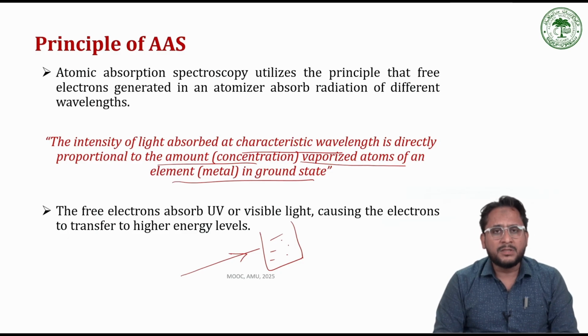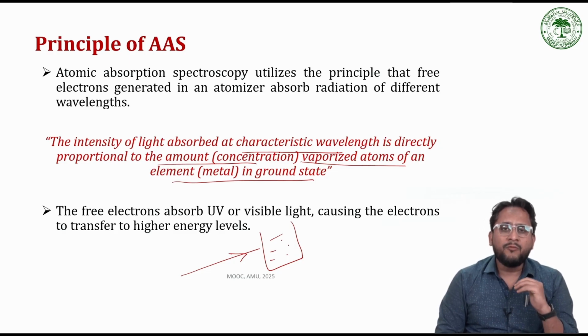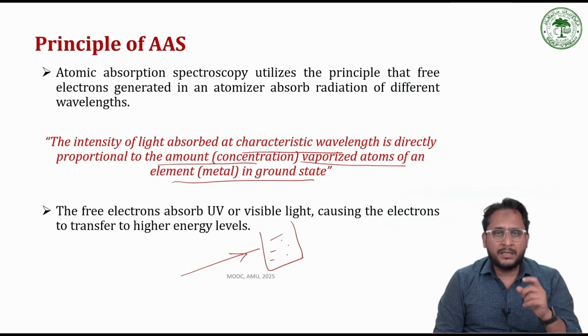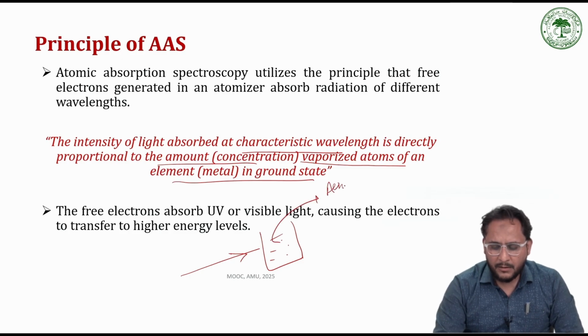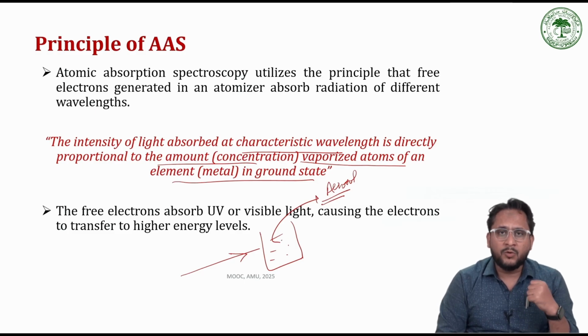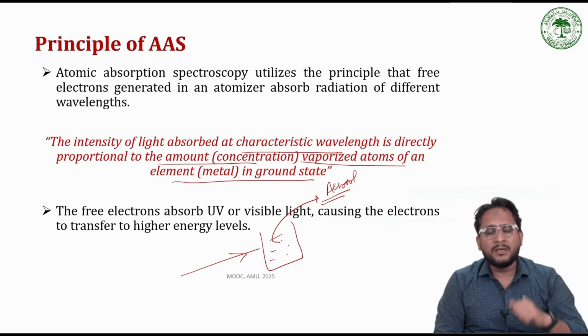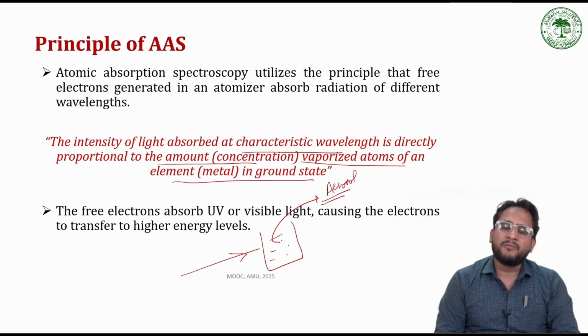One more thing worth mentioning here is that in atomic absorption spectroscopy, we do not directly excite an aqueous sample. We take the aqueous sample and use a component called a nebulizer that converts it into an aerosol. Just like the perfume we use at home, we have a liquid sample, but when we press the button and apply the perfume, it always comes out in the form of an aerosol.